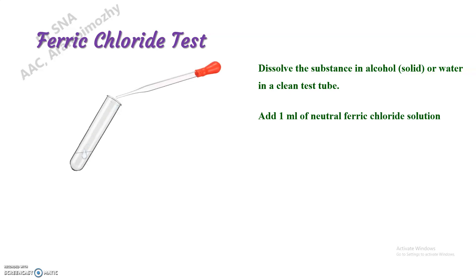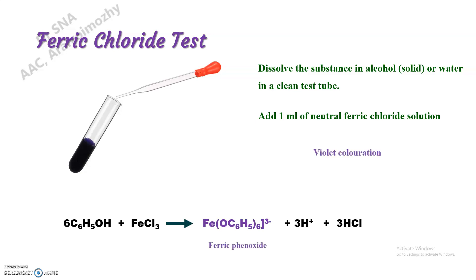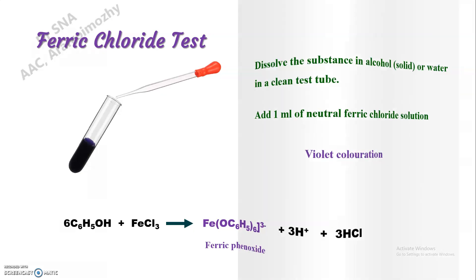We can see violet coloration due to the formation of the ferric phenoxide complex, and that indicates the presence of phenol.